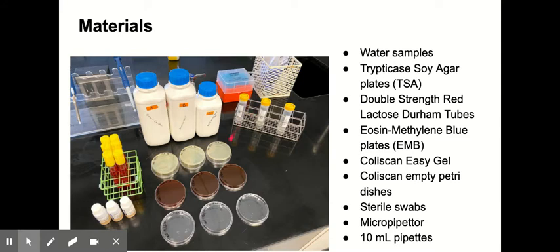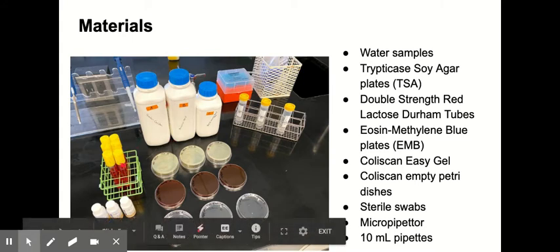Then we also had the TSA plates, which is this top row of plates here. We'll also need the double strength red lactose broth tubes, so that's this red broth over here. The EMB plates are these red plates, the second row here.